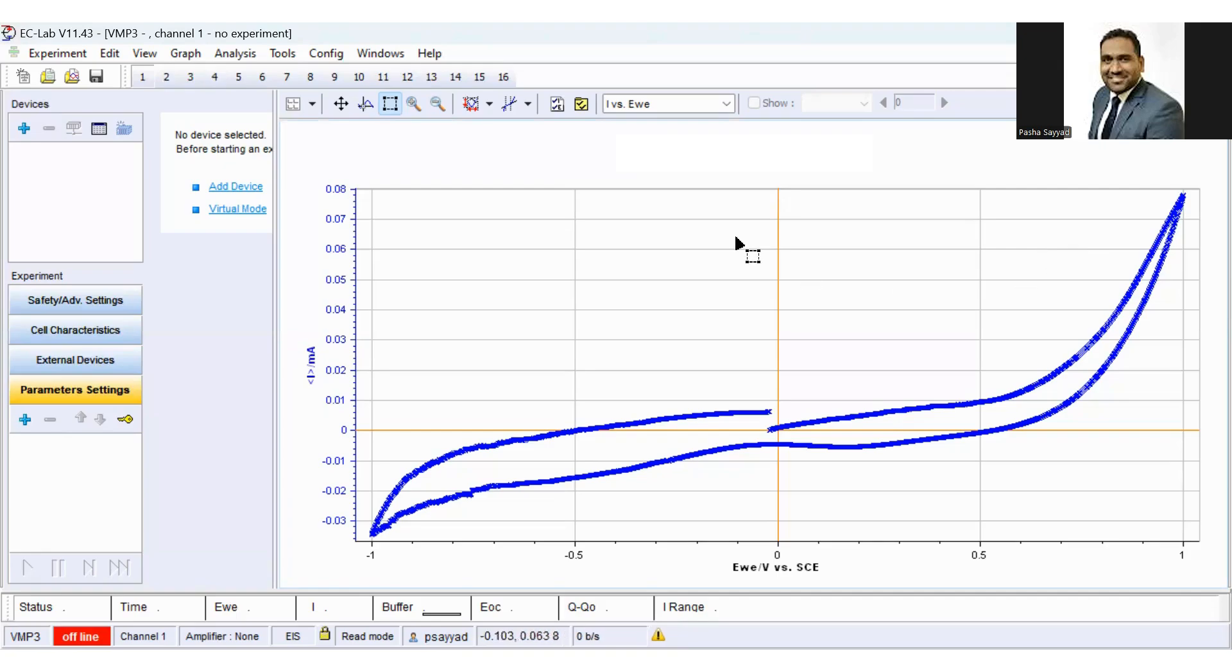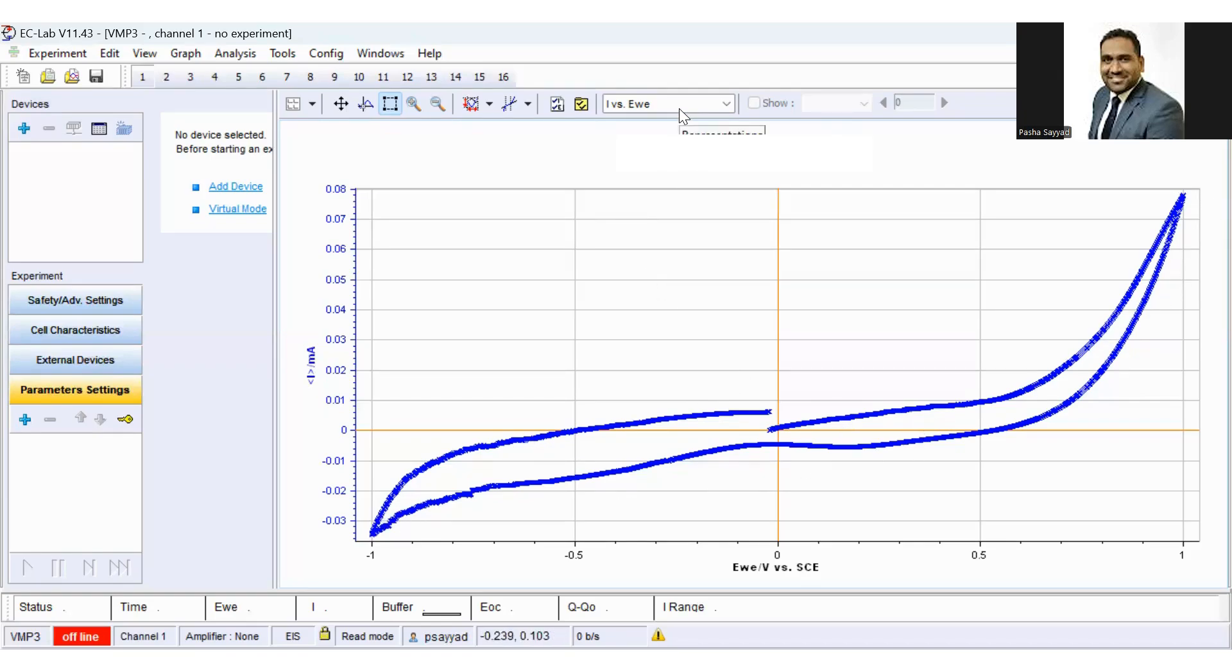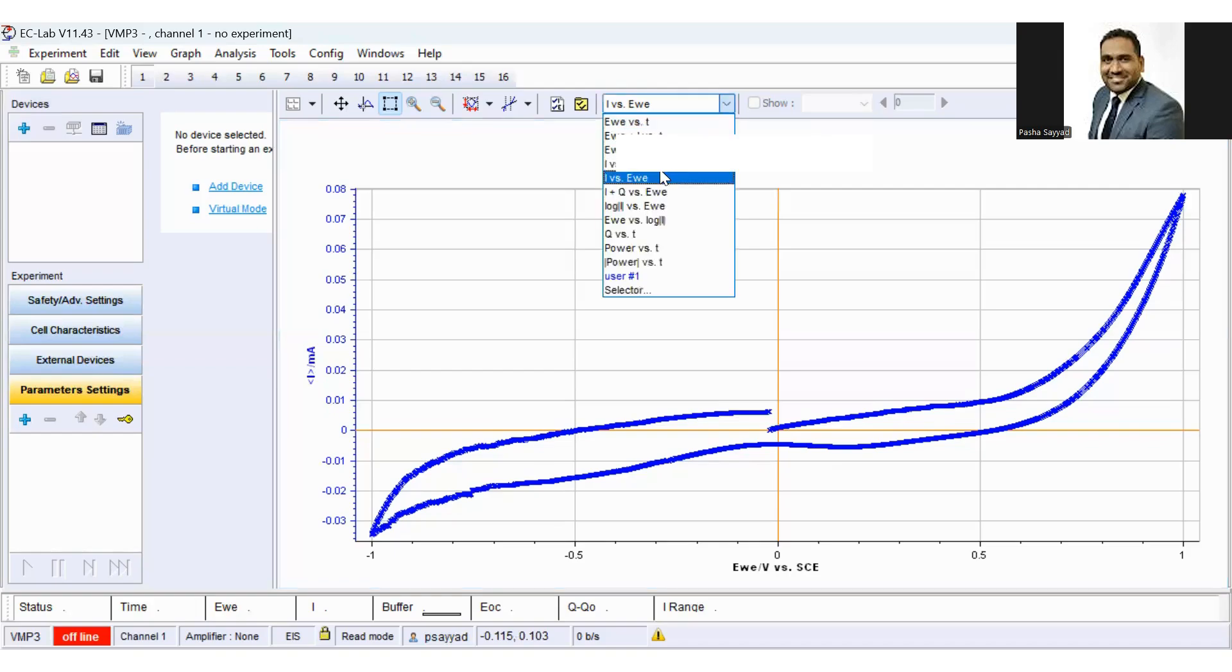In the first step, you have to convert this cyclic voltammetry curve into a current versus time curve. You can click on the representation and click on current versus time curve.